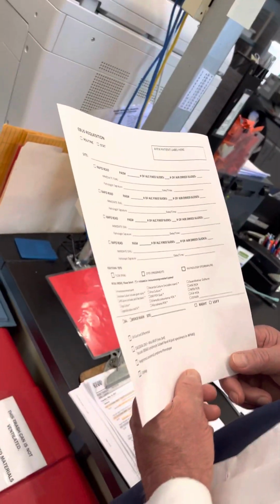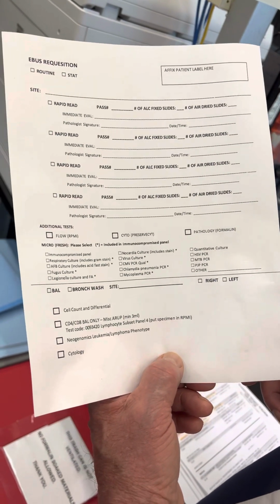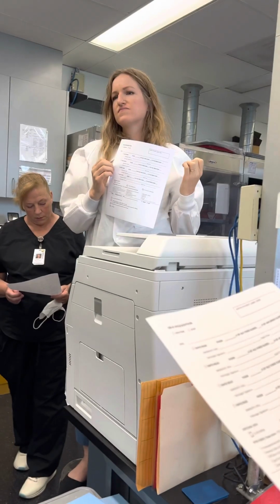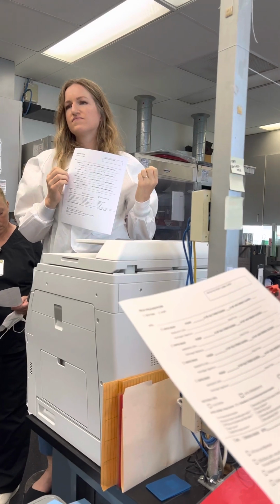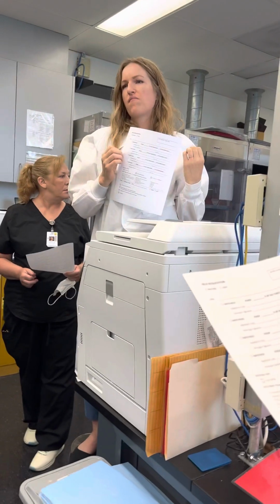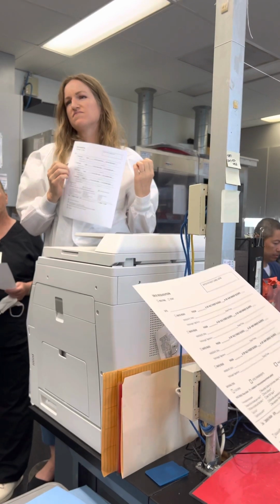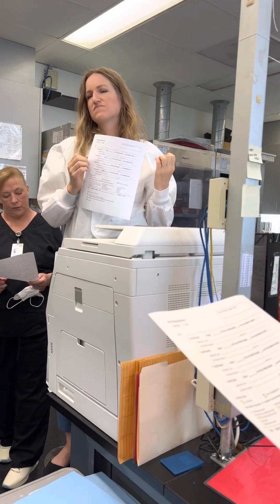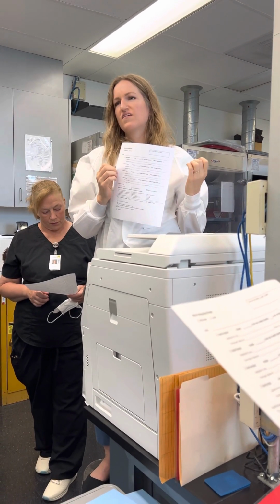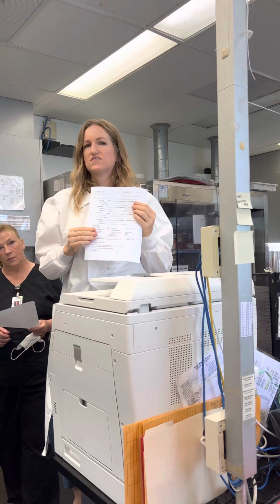That's where, a lot of times, because we process these in several different areas of the lab. So what comes here, we do the slides, we'll send out the flow sometimes, and we do the cytology and the formalin pieces. But micro, the cell counts, the hematology portion, all that gets done in a different part. And so in order to ensure that it gets to those areas, we've got to have a clear way of knowing what orders pertain to which specimen, so that we can hopefully prevent any of those missed orders from happening.